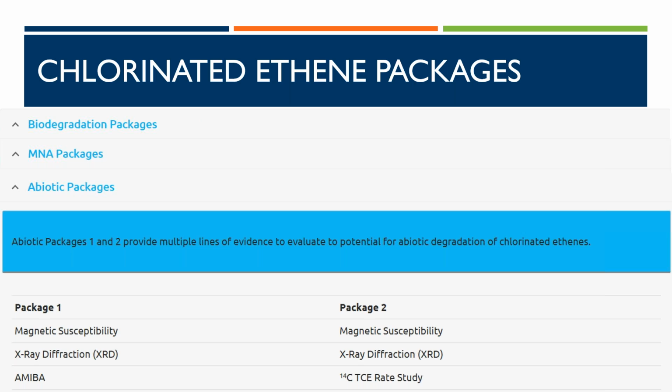This falls in line with the thing that we commonly preach at Microbial Insights, which is looking at multiple lines of evidence. So once you've seen your geochem data and once you've seen your VOC data and you know the history of your site, you might have a better idea of which of these packages would work best for your site. For example, if you happen to believe that there might be some iron present at your site, you might look at some of these abiotic packages to see what might be occurring in the subsurface of your site.